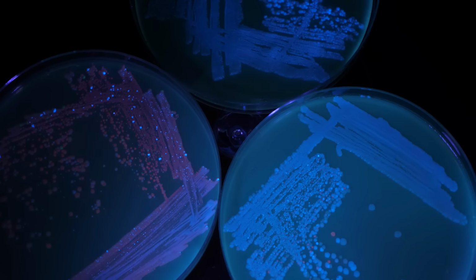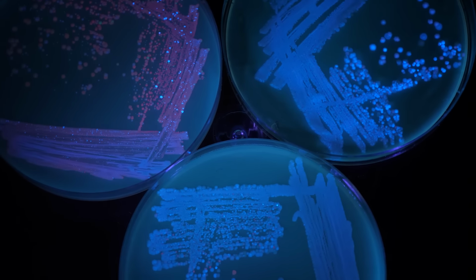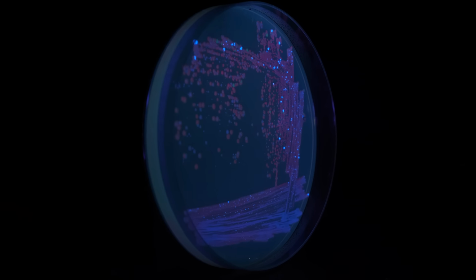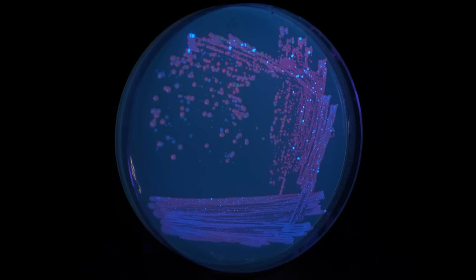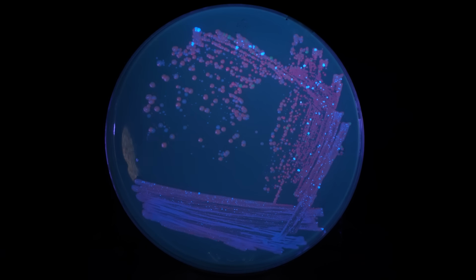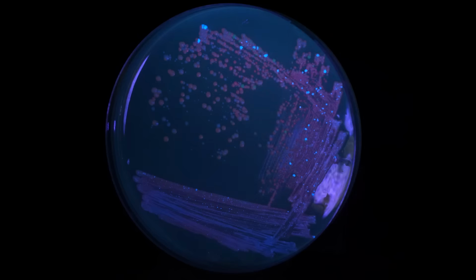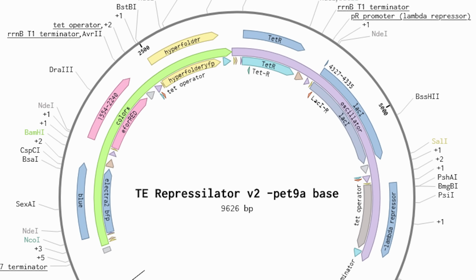I am thrilled that this worked, as it is the biggest genetic circuit like this I have ever coded up from scratch on my own, but I definitely want to make another accompanying plasmid or a second version with a built-in sponge. I'm releasing this first version as the base clock speed, and will release a faster clock in a bit.